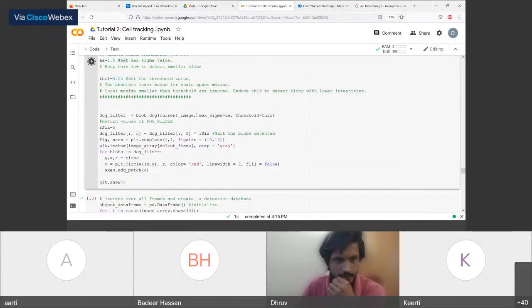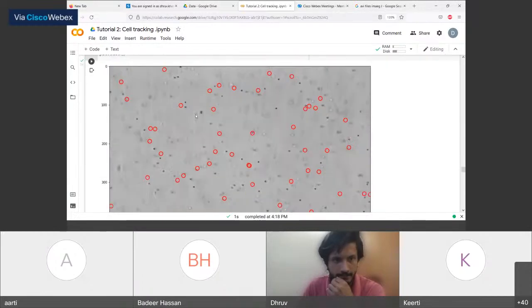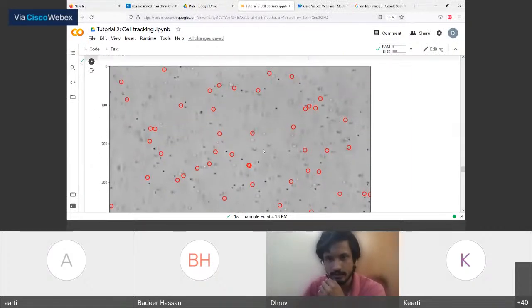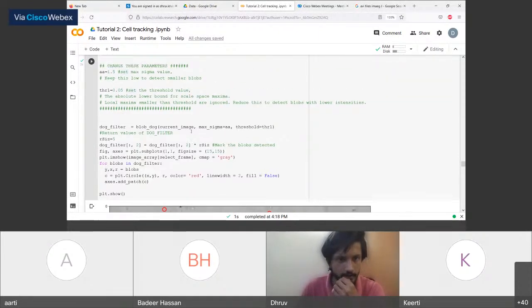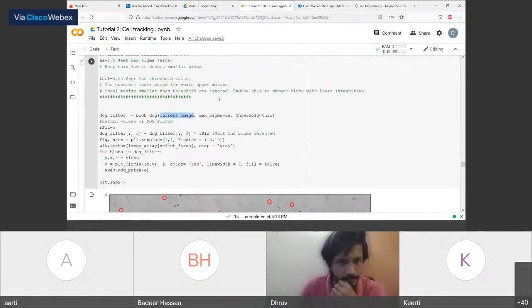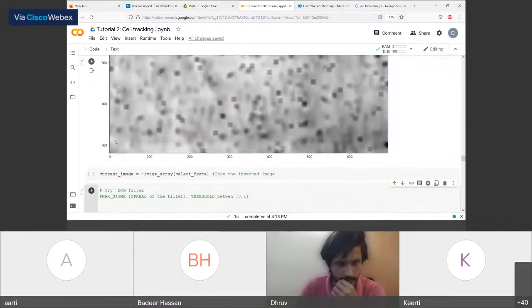Let me see what happens when I do convolution over here. I'm overlaying my detections over my input image, and what you can see is that I don't really get anything. These detections are all over the place, and I'm not locating these dark granules. So let's see what we can do to fix it.